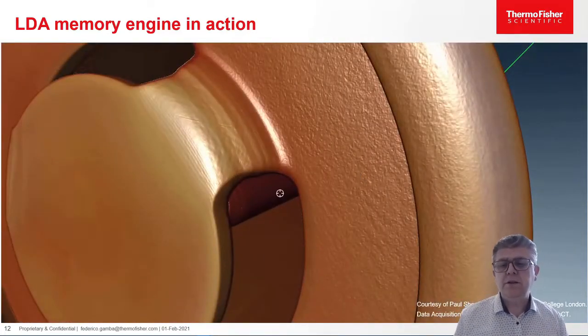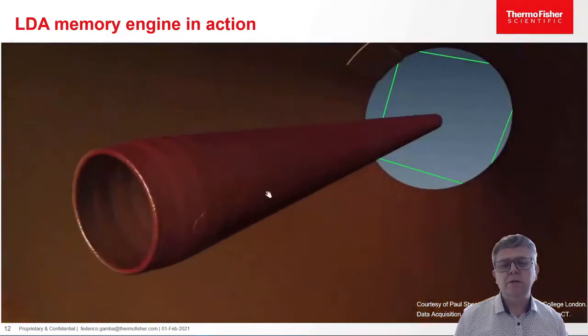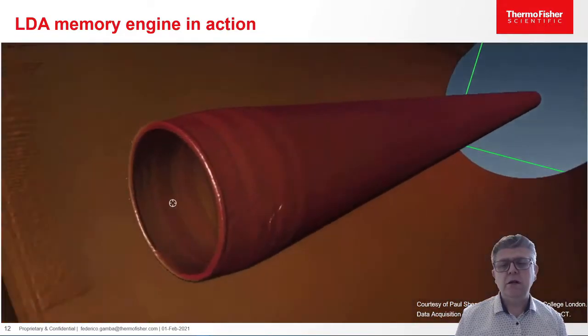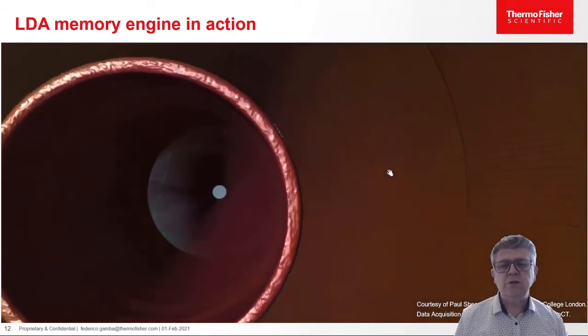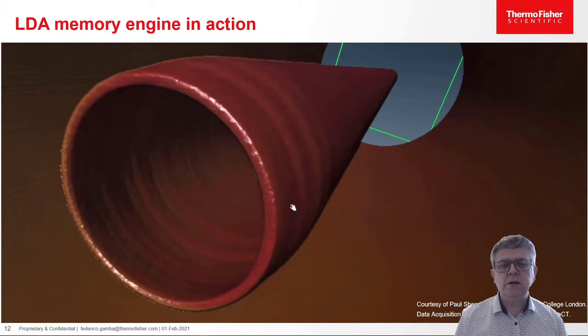In my video, I am going to zoom in like this and do a camera movement from the top of the batteries to the bottom. Very challenging because you see at the same time something near and something far. This is the typical case in which you see artifacts, right? Because the engine usually gives you a high resolution image in front and low resolution in the back.